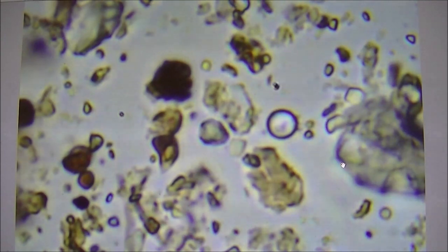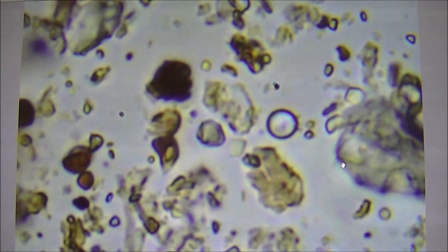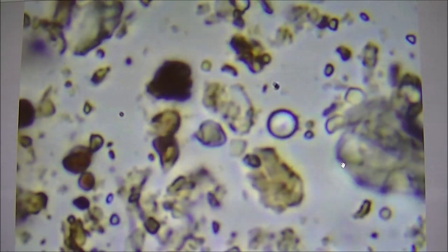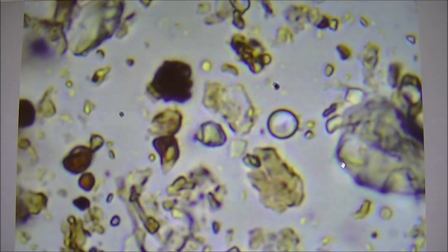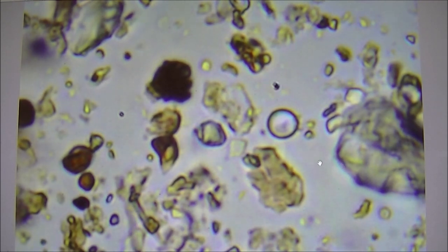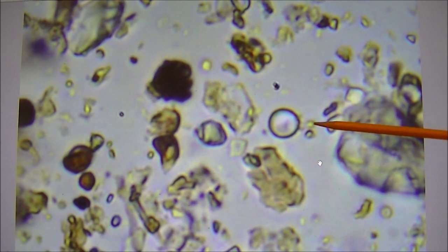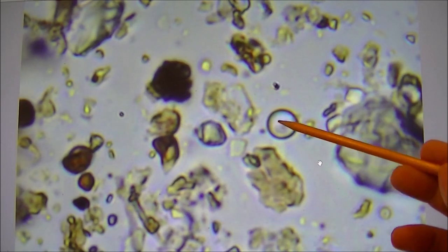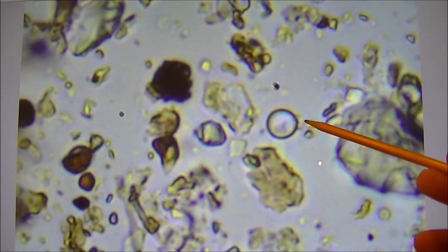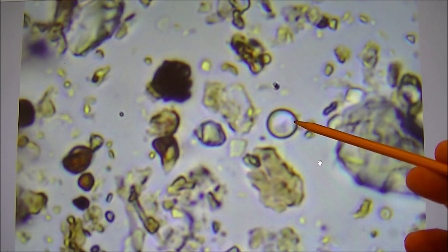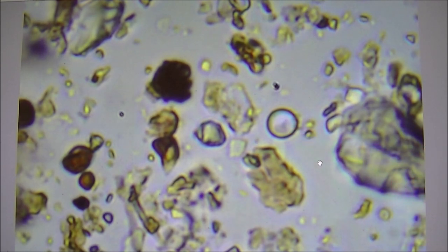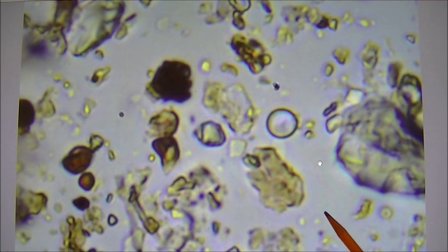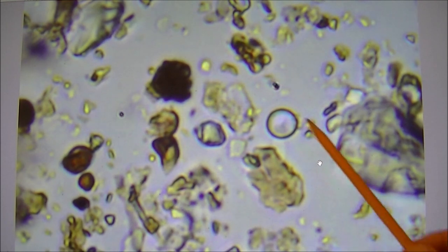Now this is interesting, there's one little round globe here. This I believe is a cilia, because it's perfectly round. On the outside edge here is bacteria that has trapped, oh it moved, so it is alive. What it does, inside here is the digestion part. It lures in the bacteria on the outer side, there's a little bit of an opening, and then will bring it inside and trap it and digest it. So there is other things in here eating the bacteria, not just the bacteria itself.